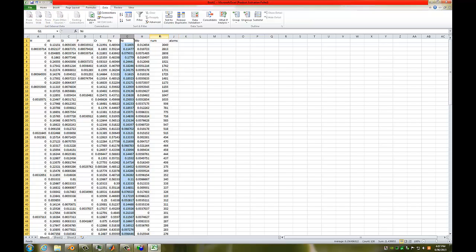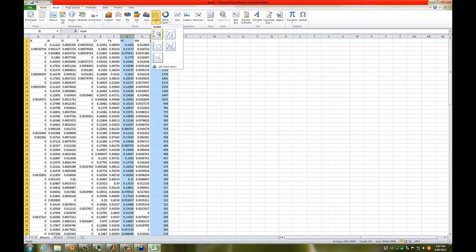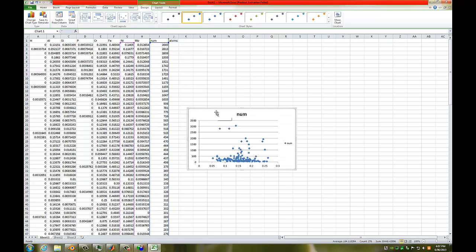Nickel versus cluster size, and you can have that as a scatter plot. So you can see the cluster size here, the nickel content here. So you can see there's a lot of spread in terms of nickel content for the small clusters, but the larger the clusters get, the more they're moving really towards a certain amount of nickel in them.